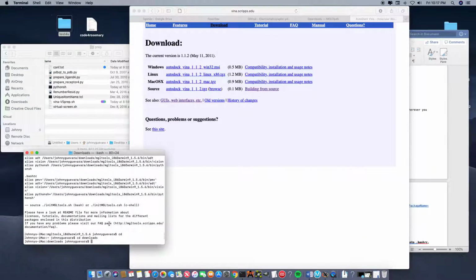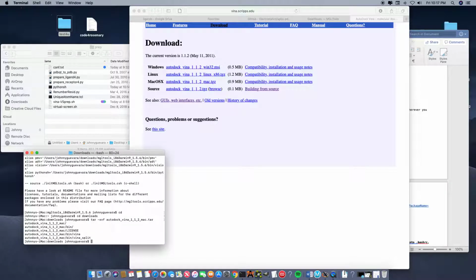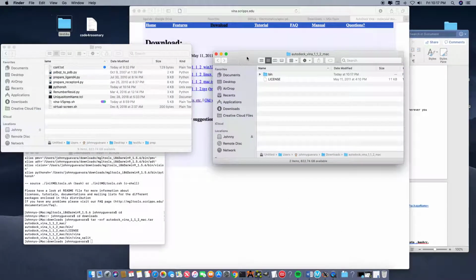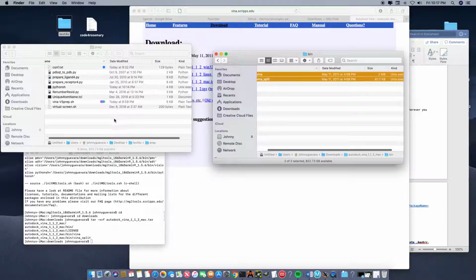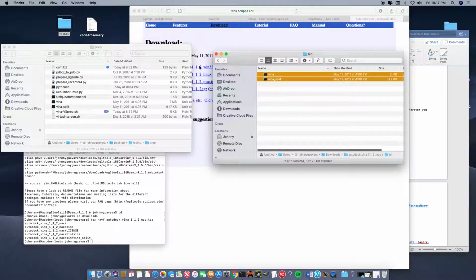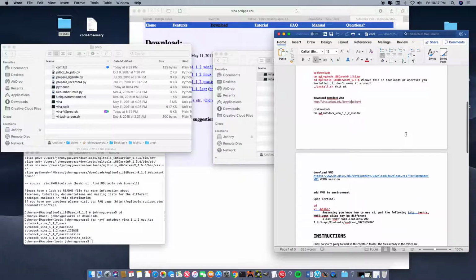So you can just tar it again. Go ahead and tar it. Makes this file. So these two, you can't transfer these between computer and computer. They're attached to different names when you do. So you gotta add your own. So that's done.